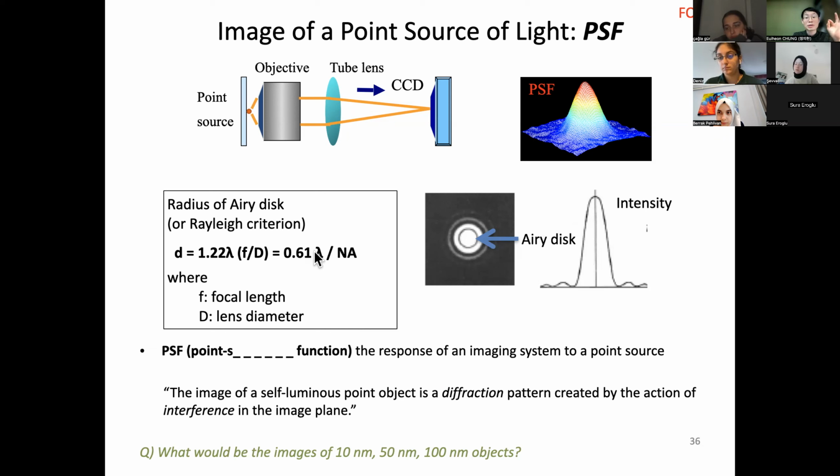That's what you want to remember. Light, or a wave, is a ruler, the wavelength, and with a ruler you can distinguish about half. But it's divided by NA, meaning that if you have a higher NA, you will have even better resolution. So that's how a point becomes your image, which will be spread.